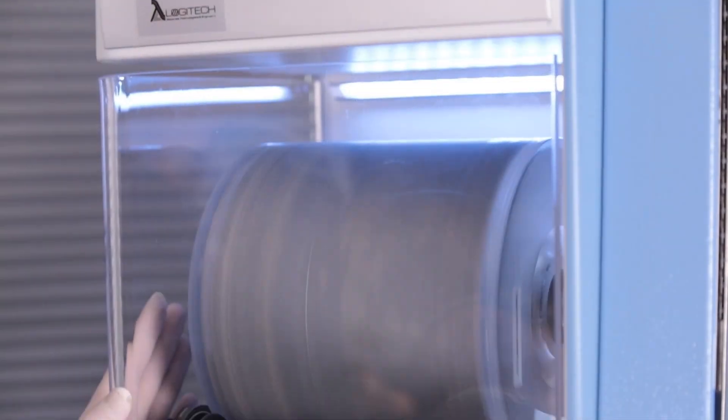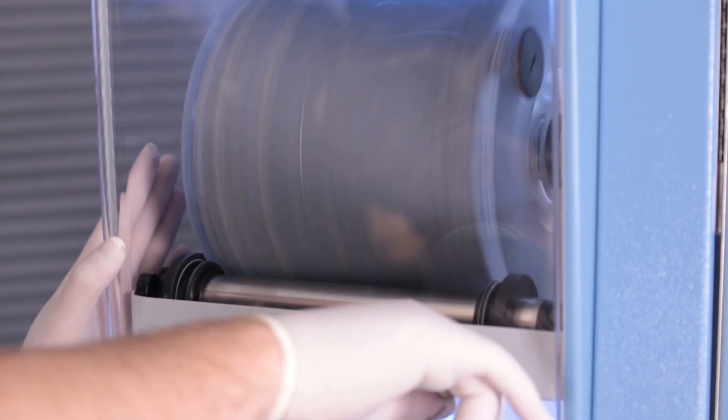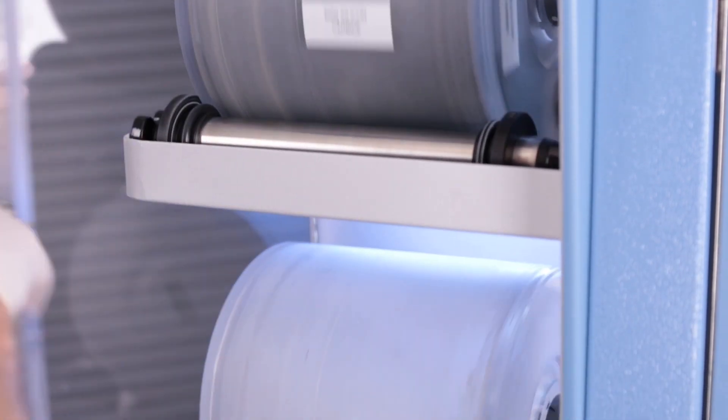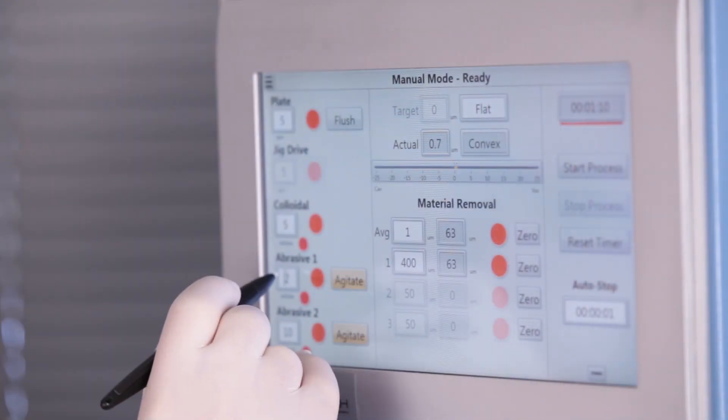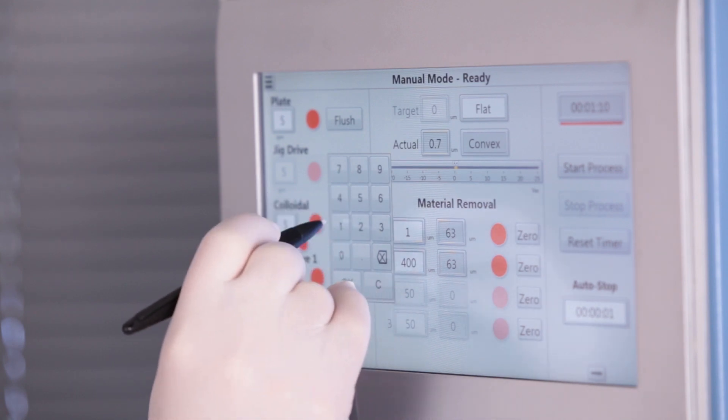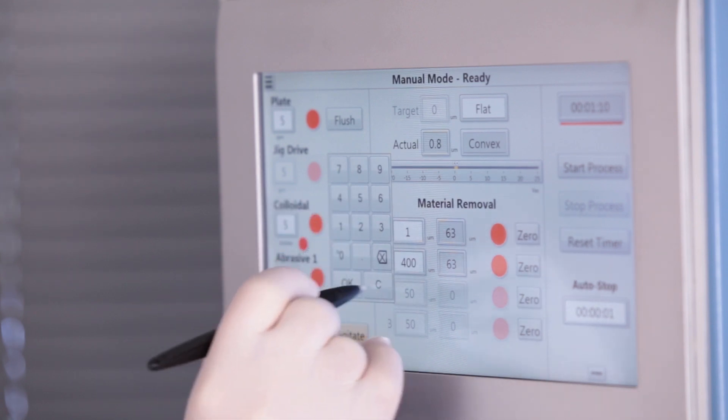You've got twin slurry tanks for extended process of sample and or multi-stage processes. Plus you've got a handy touchscreen, which can enable you to accurately deliver slurry from the peristaltic pumps controlled within.